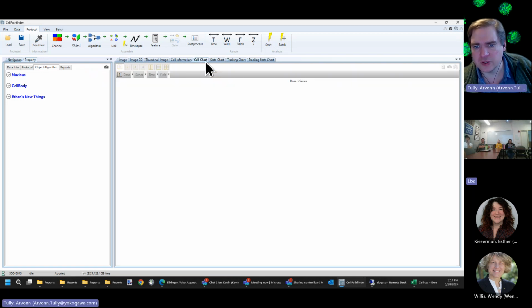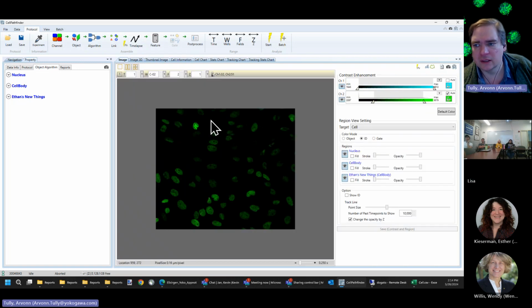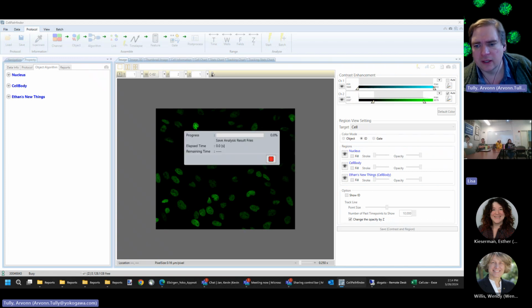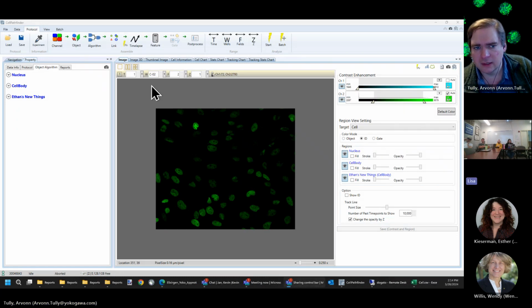I mean, it should actually show that stuff here. Something funny is going on. Because normally, once you're satisfied with that, you hit start, and it goes through and runs the analysis. But I'm not seeing the objects here. So something screwy happened.